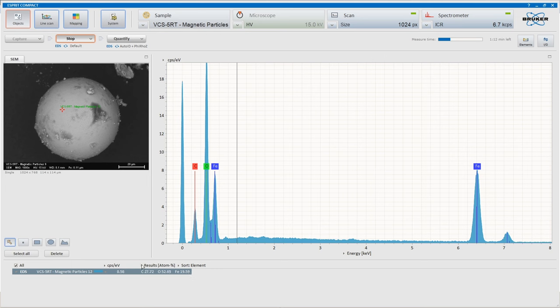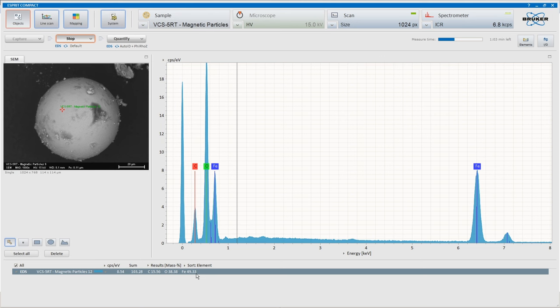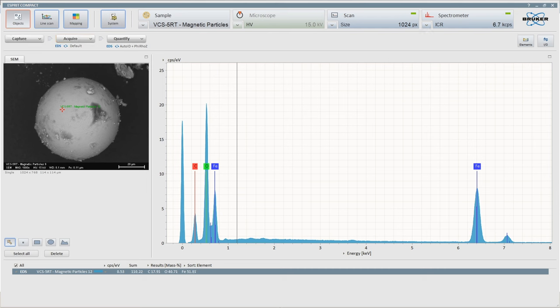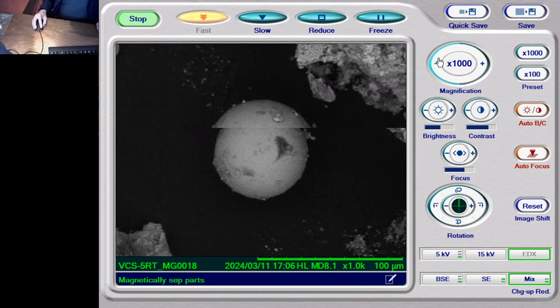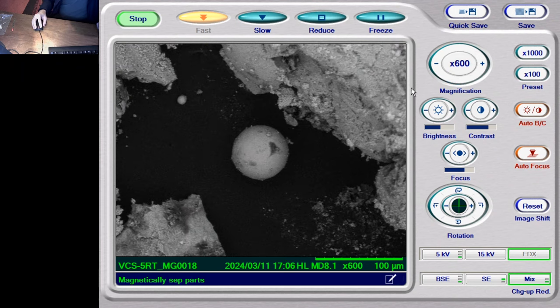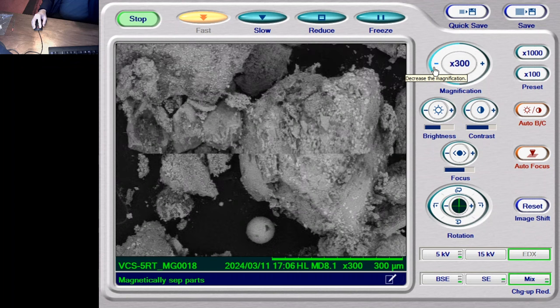20% iron, that's by atom percent, so if I go to mass concentration here, it's nearly 50% iron. Yep, that is over 51% iron, and over 40% oxygen with a little bit of carbon by mass. So we'll have a look at one of the other structures there. Later we will look at these magnetic agglomerations. There we go.